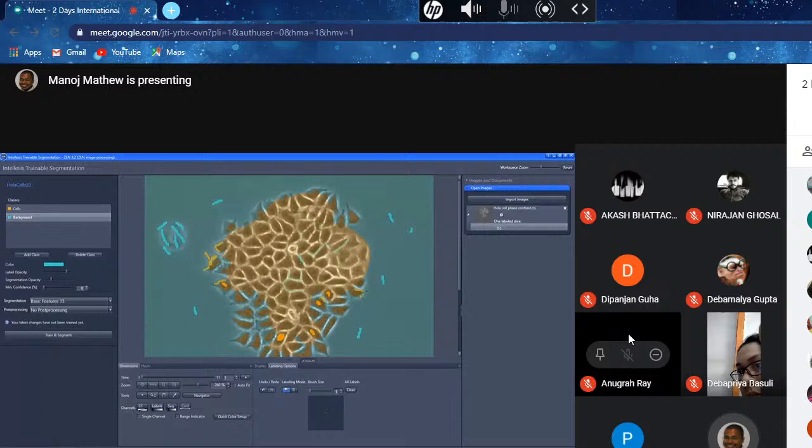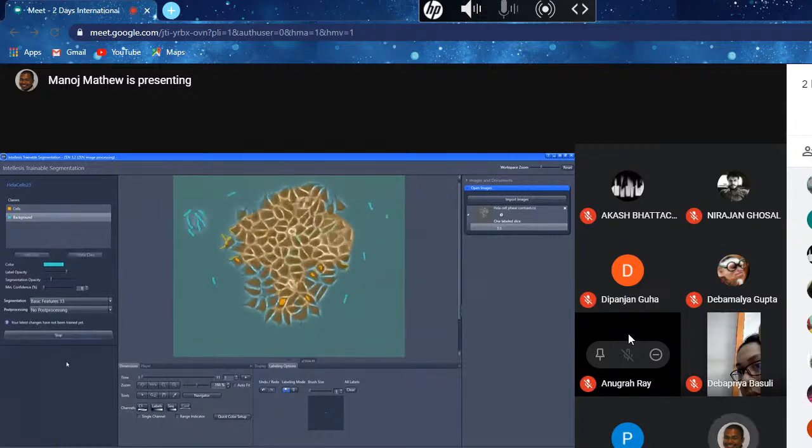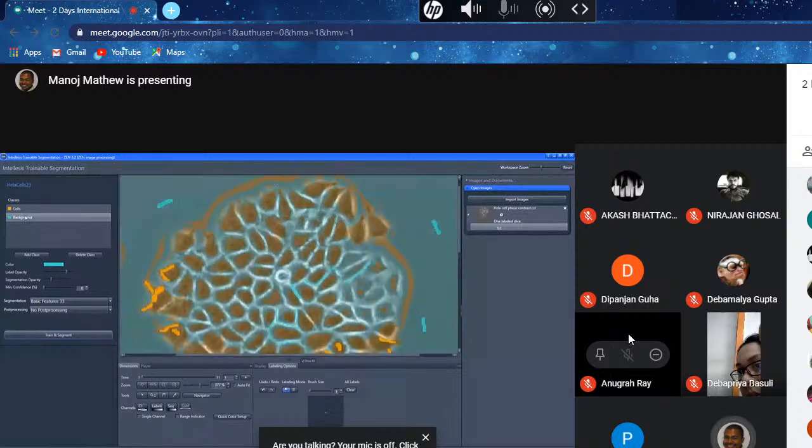All right, let's see what happens now. With machine learning, there's always a possibility that the system starts to learn in a very wrong way as well, because we have to test it out. Here, if you actually look at it, our situation improved from the previous situation, right? The space between the objects is now more clearly identified. It made some additional mistakes, which is fine. I can refine this.